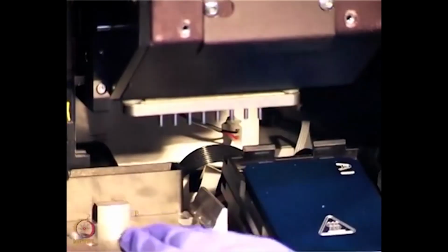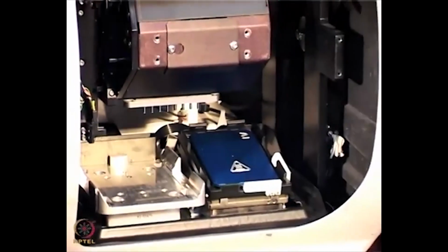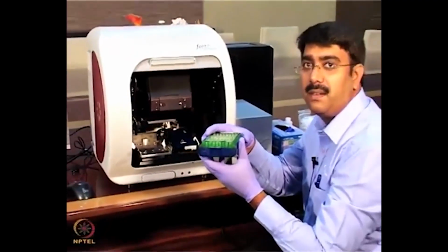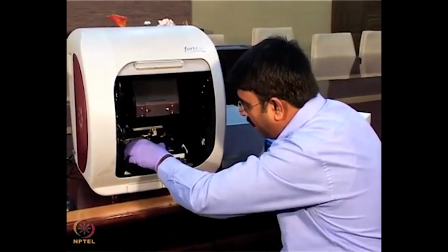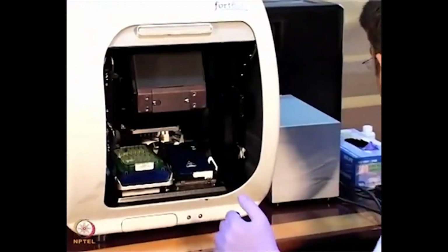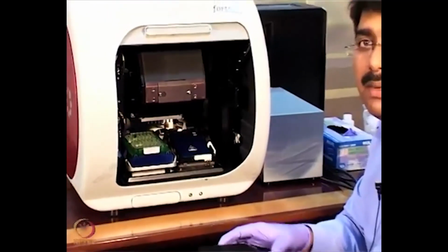Here this is the sensor compartment, and this is the sample compartment. Now you can see this is the sensor holder, or sensor manifold. We can put the sensor in this fashion, and then we can put the sample. This is the 96 well plate format. We can analyze 96 samples in one go.